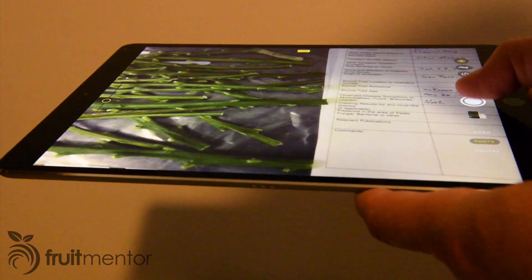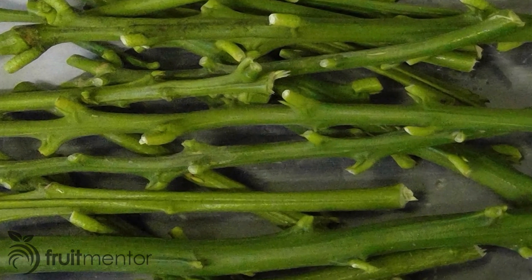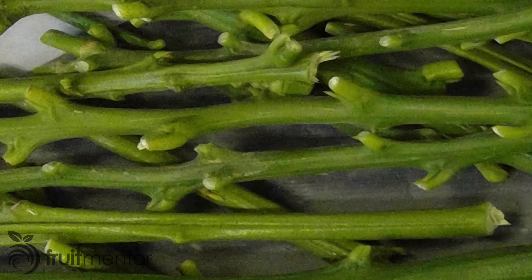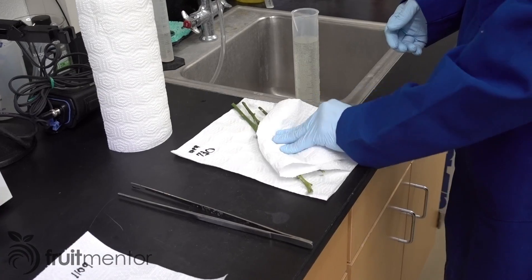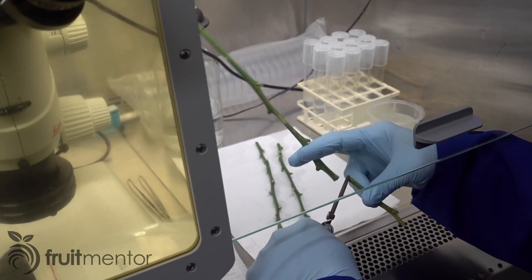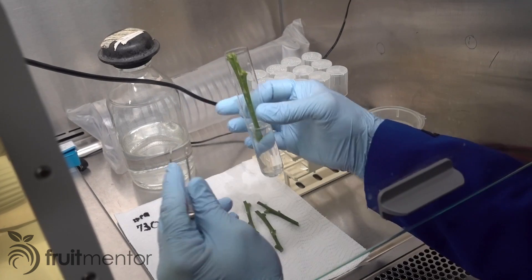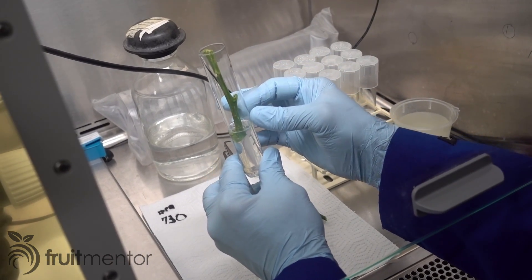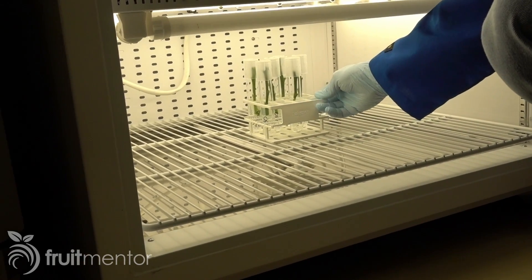When the cuttings arrive at the CCPP lab, the lab technician first photographs them to document their condition. The cuttings are then surface sterilized in a solution of chlorine bleach. Next, the cuttings are cut into shorter pieces and inserted into test tubes containing a plant growth medium. The tubes are then placed inside an incubator.